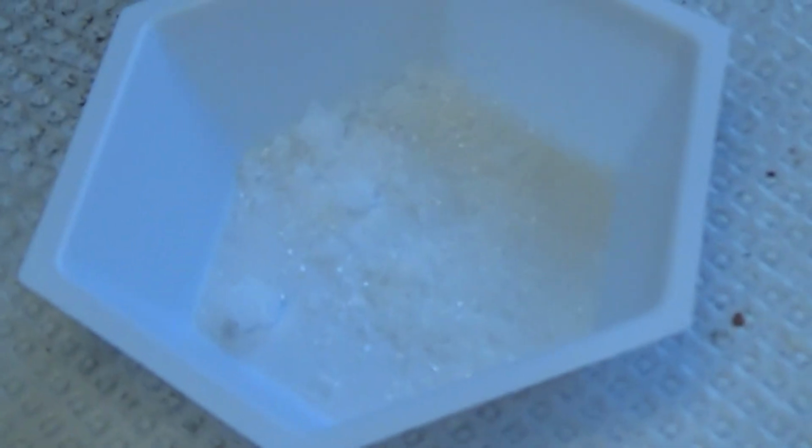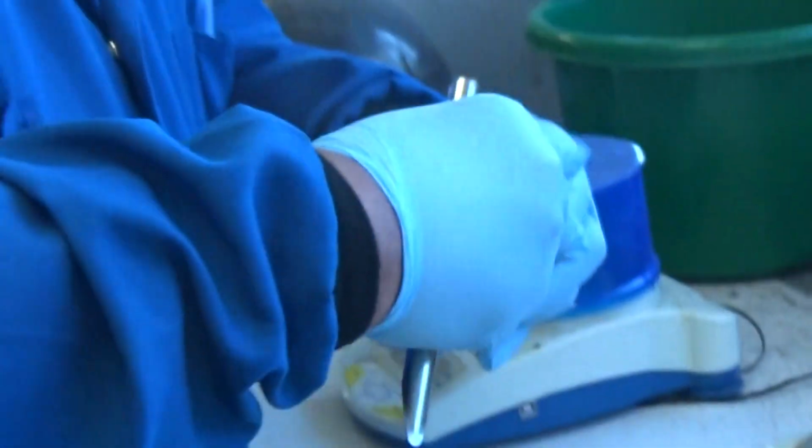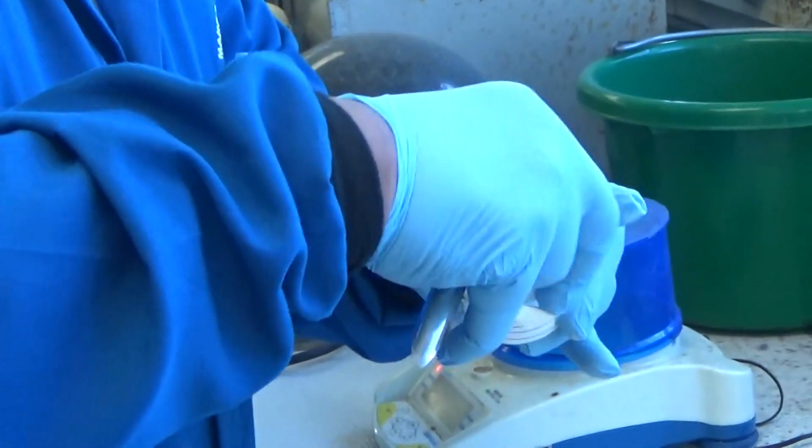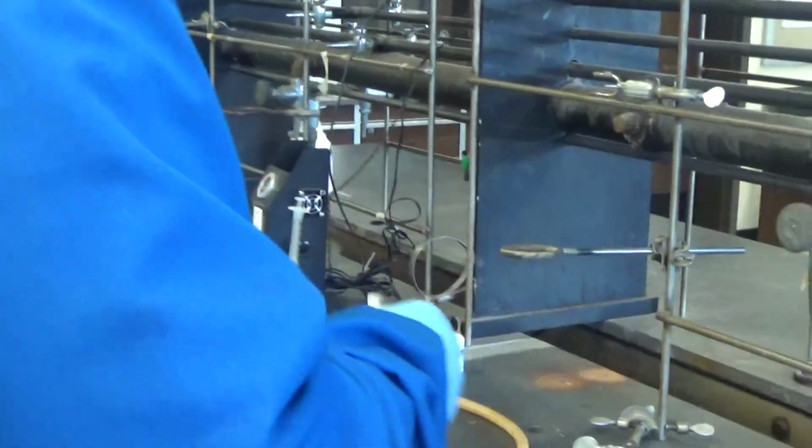It's a weird white solid. It looks like sugar, actually. Sucrose is an alcohol, and a lot of alcohols look kind of the same way, like table sugar.